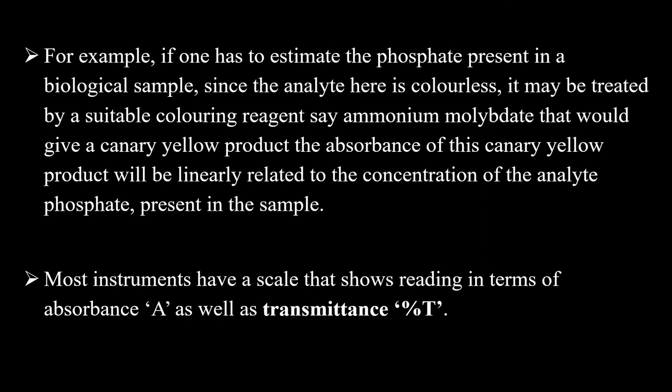For example, if one has to estimate the phosphate present in a biological sample, since the analyte here is colorless, it may be treated with a suitable coloring reagent. Say that particular reagent is ammonium molybdate. That would give a canary yellow product, and the absorbance of this canary yellow product will be linearly related to the concentration of that particular analyte, which is here phosphate, present in the sample.